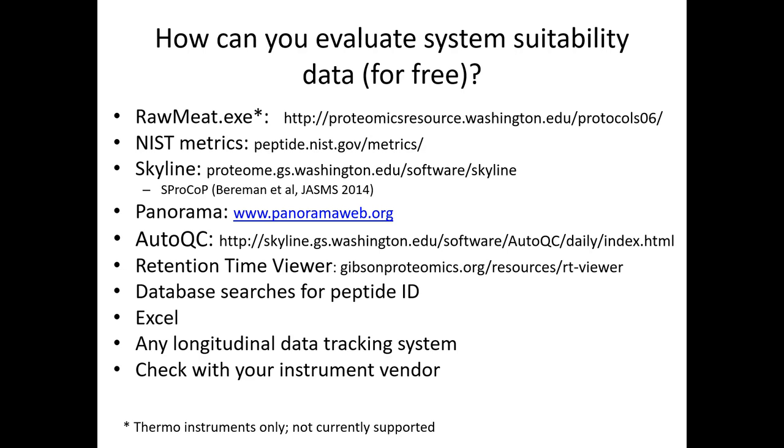Database searches for peptide ID are one way. A lot of people use how many peptides they got from their yeast cell lysate in a system suitability run, a number, and that's decent. It's not the only thing I would do.